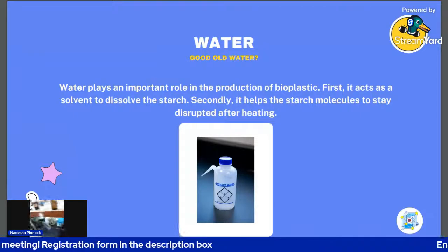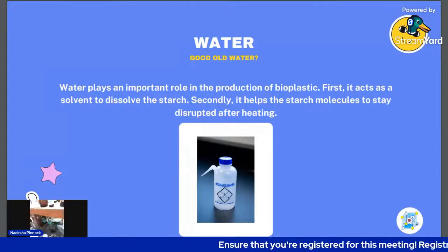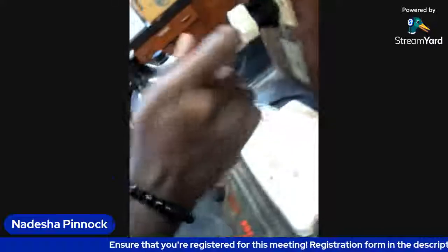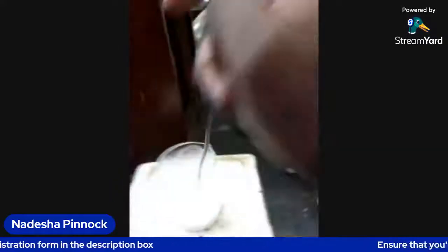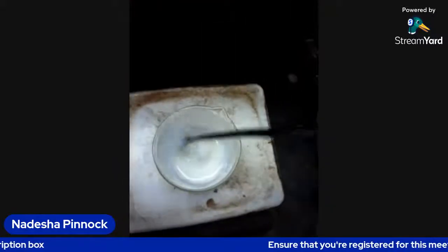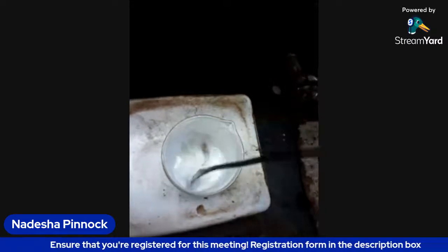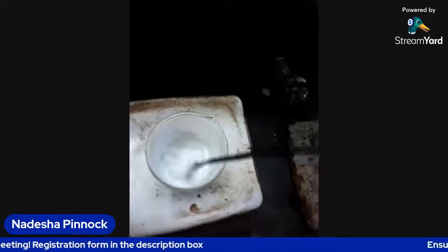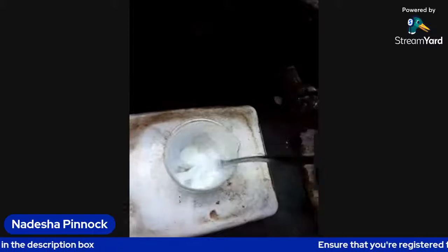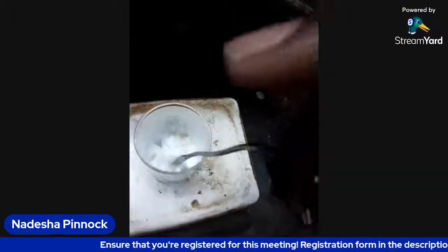So now we're going to take a look at our experiment and the progress of the experiment. So right now we have the solution thickening. So it's thickening. Let me show you. There we go. So we might have to soon take it out so that it doesn't harden up in the beaker. Right, so that's the plastic forming.